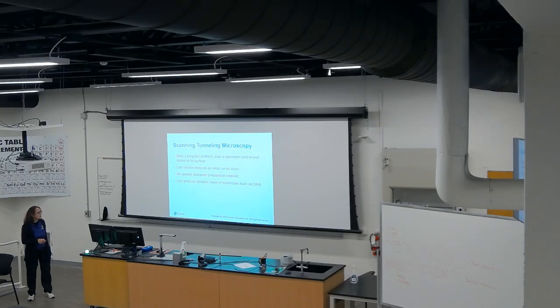And you don't need a special preparation of the specimen, so it saves time. One of the most laborious or more tedious processes in microscopy is to prepare specimens for TEM, transmission electron microscopy. But with this one, you just bring your sample, you put it in this microscope, the probe will go over, and then it can show you your image right away.